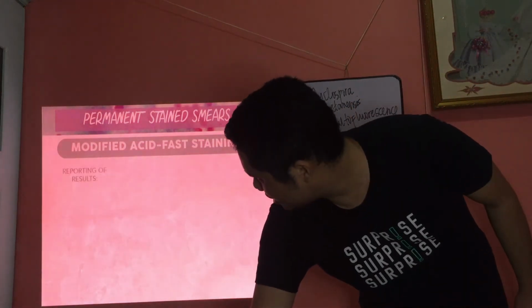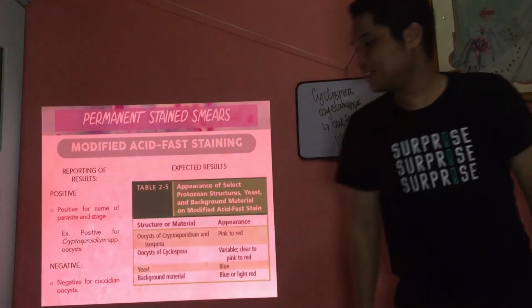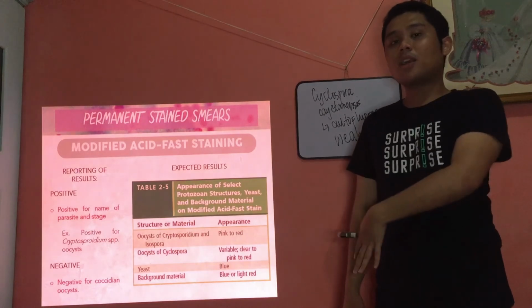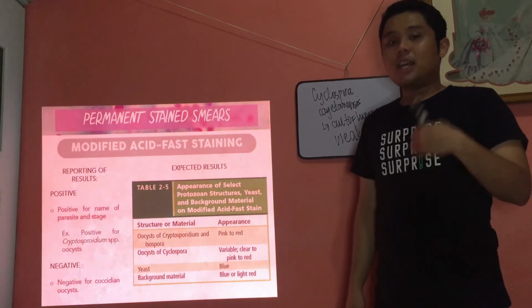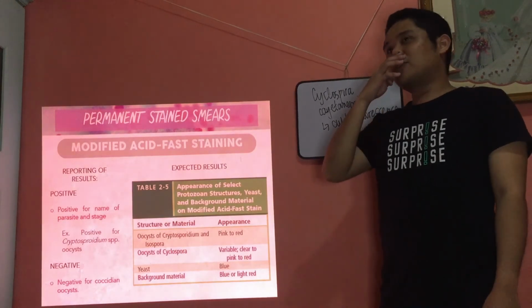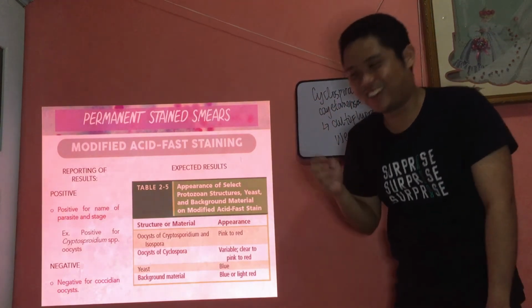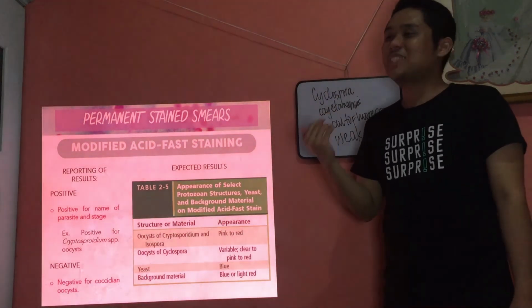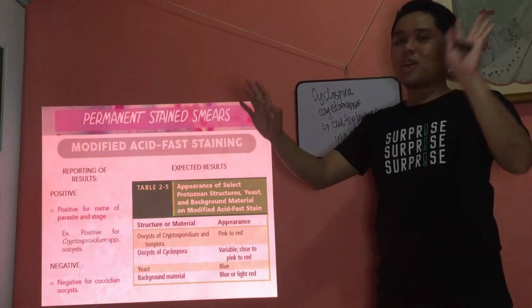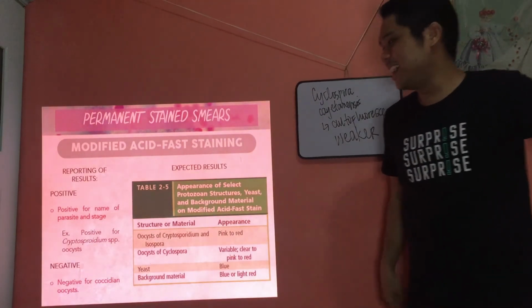Alright, now here is your results. Still the same. An expected color. Okay, so positive for name of parasite and stage, positive for Cryptosporidium parvum, Cryptosporidium spp. oocyst, and then negative for Coccidian oocysts. Diba? So if na kay Beshi, yan na yung mga tanan mo, like oocysts. Okay. Mukha ka ron, oocysts. O, diba? Ayan. So, one Coccidian to another or one Beshi to another oocyst. Kung mo-agree mo. Charot. Okay, Mark. Sige na, daming joke. Okay.